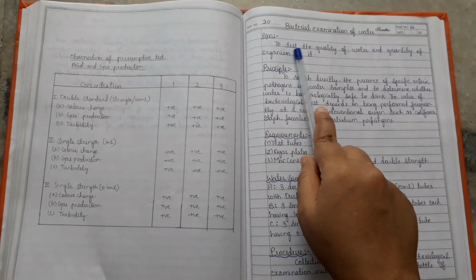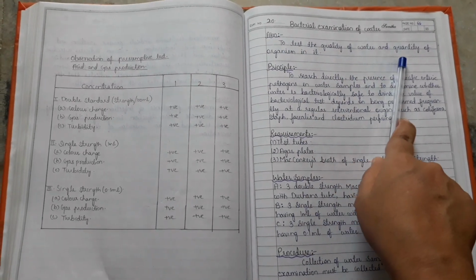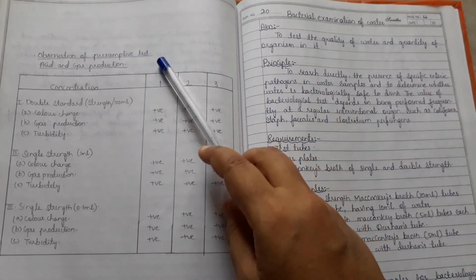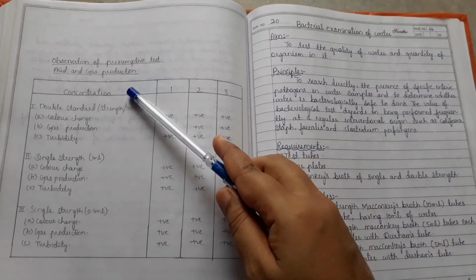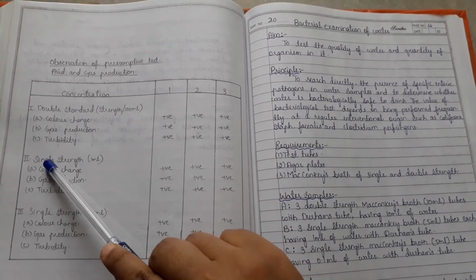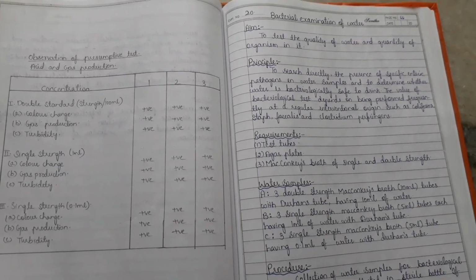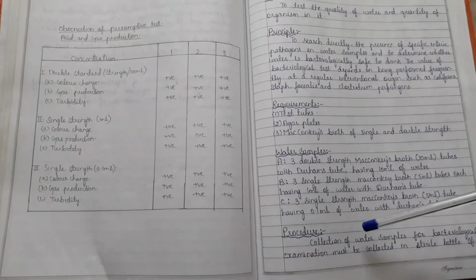Coming to the bacterial examination of water, to test the quality of water and the quantity of organisms in it. Observation of the presumptive test: acid and gas production. What are the concentrations we are taking? The first one is double strength, the second one is single strength, and the third one is single strength with 0.1 ml. Here we are taking 1 ml. So this is the principle and the procedure.